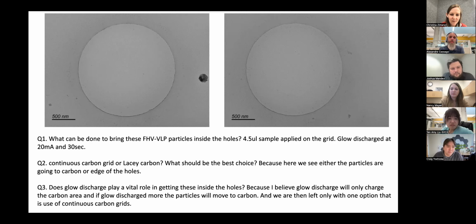And in terms of working with the sample, if you can't concentrate it more, you can always double, triple, quadruple blot. You can always play with surfactants and maybe a little bit of cryoprotectant. I think Gabe Lander had that paper where he showed that even much higher concentrations of glycerol than most people thought usable are still valid. You can still collect good data. So I think you can play with things like that in the buffer. I mean, it was up to 30% glycerol, if I remember correctly. Yeah.